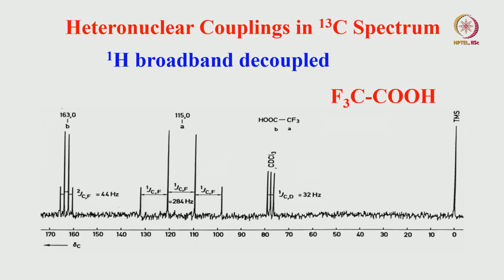Okay, so we can start analyzing one molecule, and then before we go further, we can stop and discuss many other things in carbon 13 later. This is a simple molecule. Carbon 13 proton broadband decoupled, which is very nicely written. I should have written here 1H in the flower bracket. What is the type of spectrum you are going to get for this molecule?